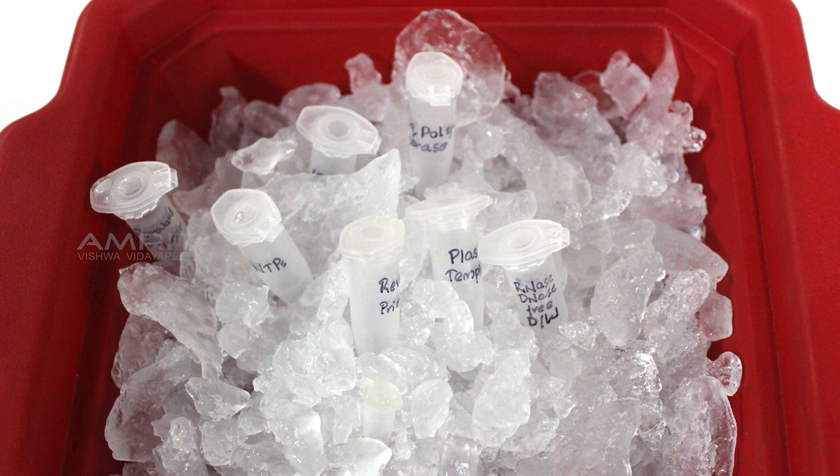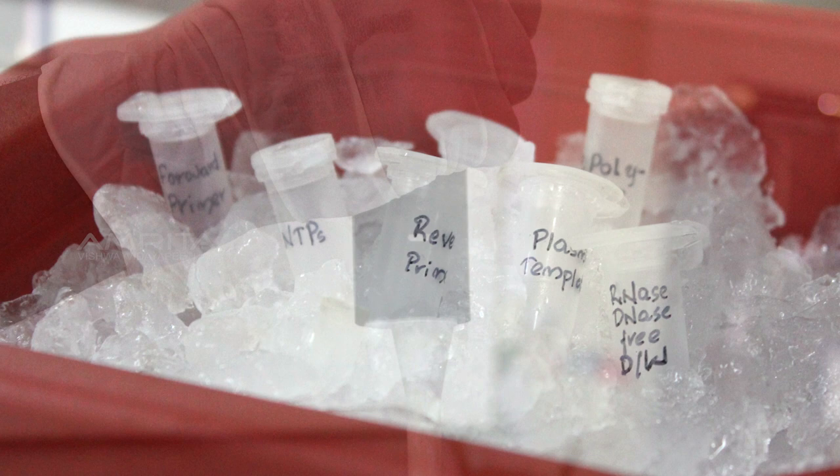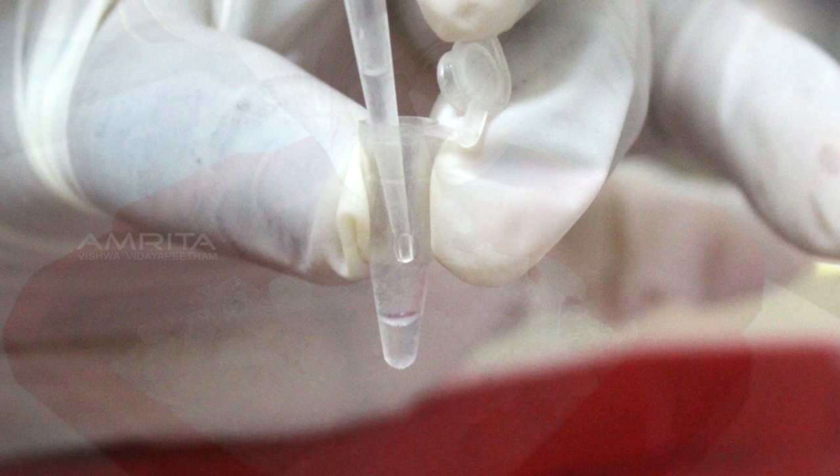Procedure: Arrange all tubes in the icebox. Take a 10 to 100 µL pipette and adjust the volume to 37.5 µL. From the tube placed in the icebox, pipette out RNase-free, DNase-free distilled water and add the solution into a 0.5 mL PCR tube taken from the icebox. Place this PCR tube back in the icebox and discard the used tip.